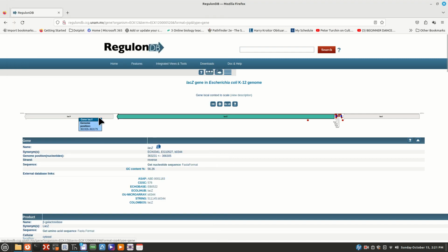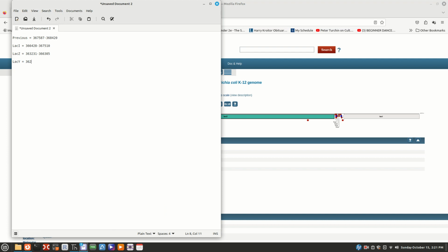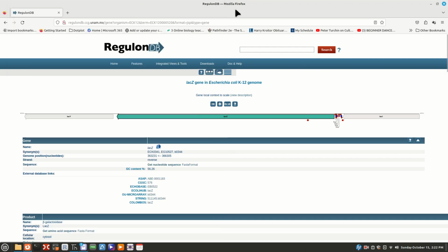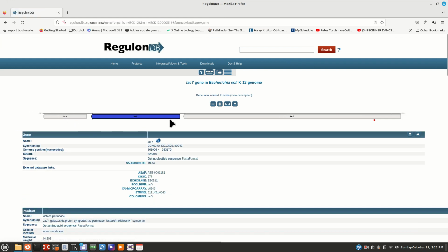Now you're going to have to do this for all of your genes. 361926. 361926. 361926. And that goes to 363179. 363179. 363179. Did I get that right? Yes. Okay, now we can go to what?